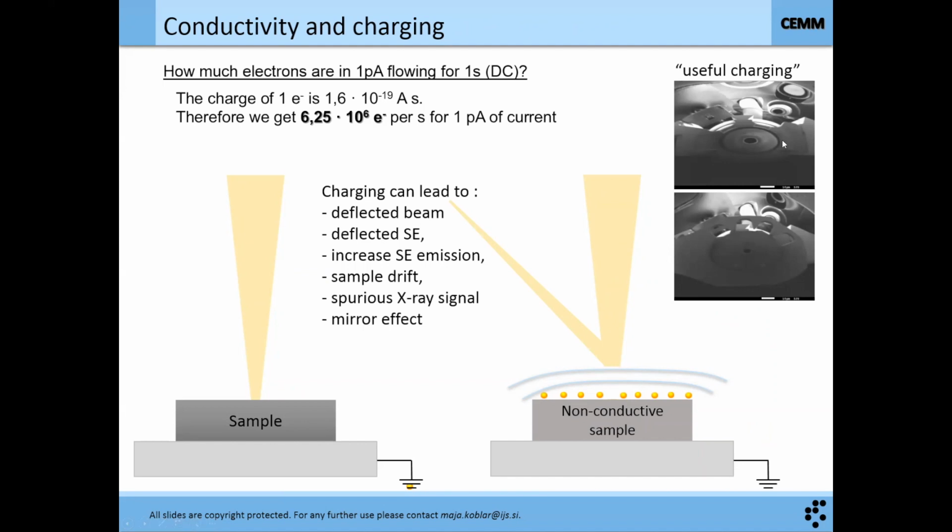This is kind of neat because if you don't have, like on the Quanta, to open the chamber to see the inside, you can see where the detectors are. So this is the JEOL 7600F. You can see the WDS, the EDS, the lower detector, and you can see the backscatter detector. So sometimes it's useful, usually it's not useful.